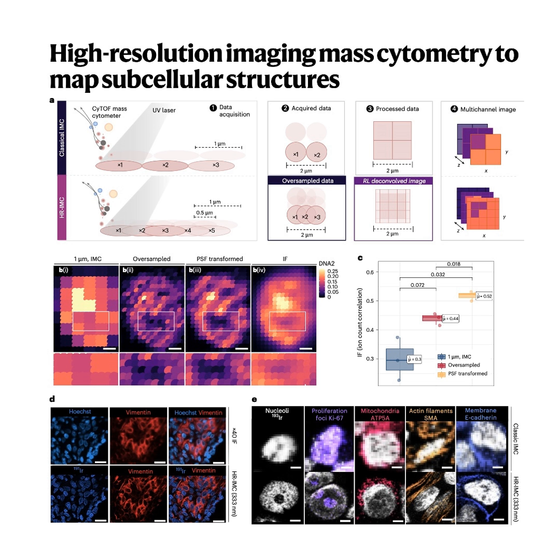And what about inside the nucleus? There, they could clearly delineate nucleolus-resembling structures, which are vital for ribosome production. And crucially, they saw sharp, distinct Ki-67 foci in interphase cells. And Ki-67 is a proliferation marker, right? It is. Before, that signal was just a uniform blob inside the nucleus. Now, they can see specific active areas of proliferation. It gives you a much richer understanding of a cell's division state. They also showed much sharper filamentous SMA fibers, part of the cytoskeleton, which allowed for better structural separation.